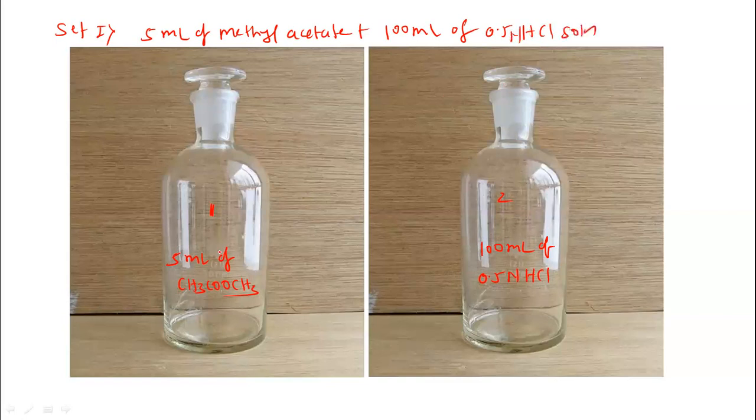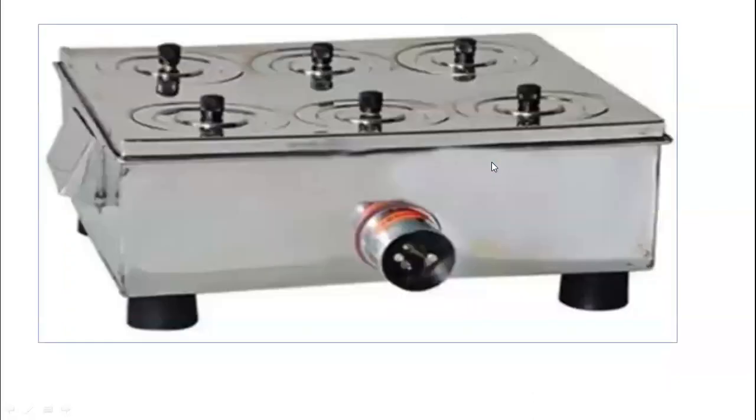Now, after taking the solutions, these two bottles are kept in the water bath to attain the room temperature. You can see here, this is the water bath.